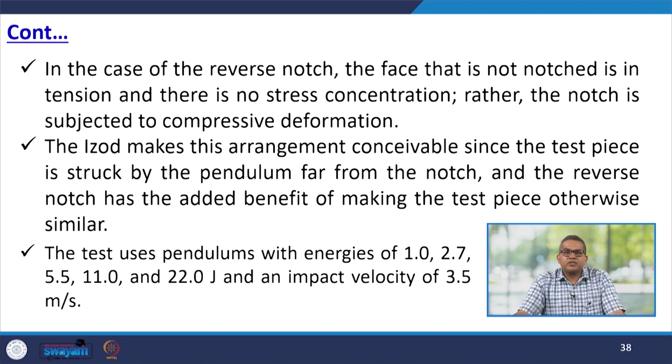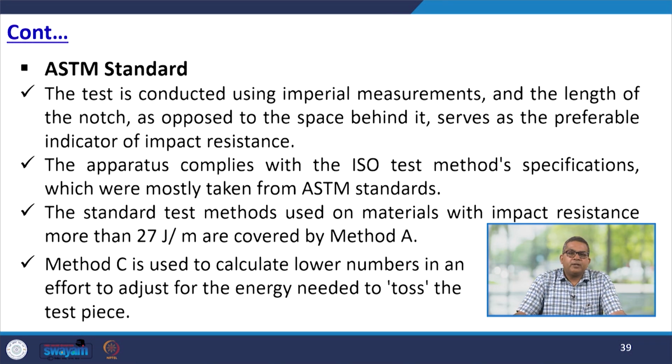Now, in case of the reverse notch test, the face that is not notched is in tension and there is no stress concentration, rather the notch is subjected to compressive deformation. The Izod makes this arrangement conceivable since the test piece is struck by the pendulum far from the notch, and the reverse notch has the added benefit of making the test piece otherwise similar. The test uses pendulums with the energy of 1, 2.7, 5.5, 11 and 22 joule and an impact velocity of 3.5 meter per second.